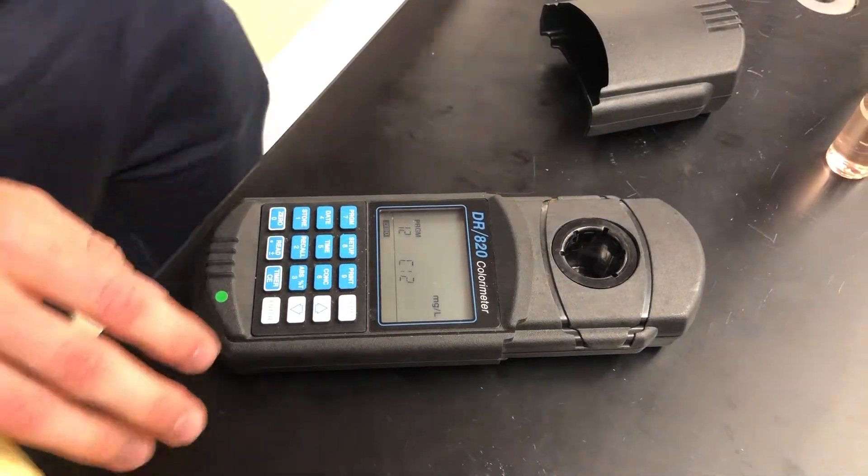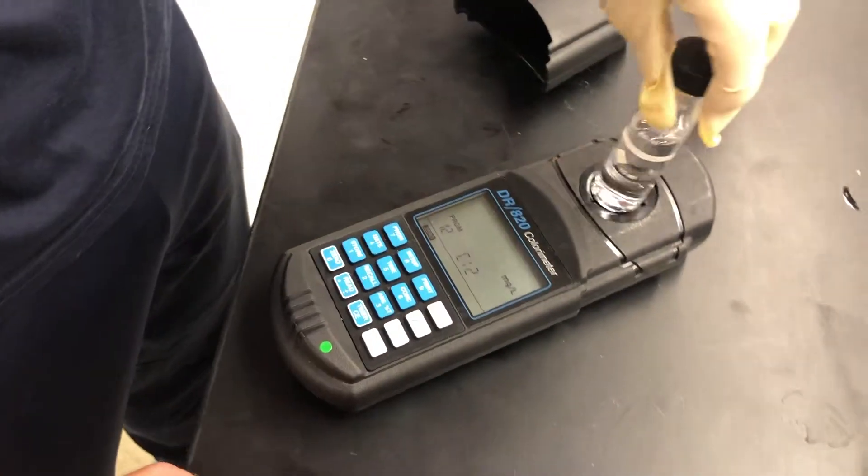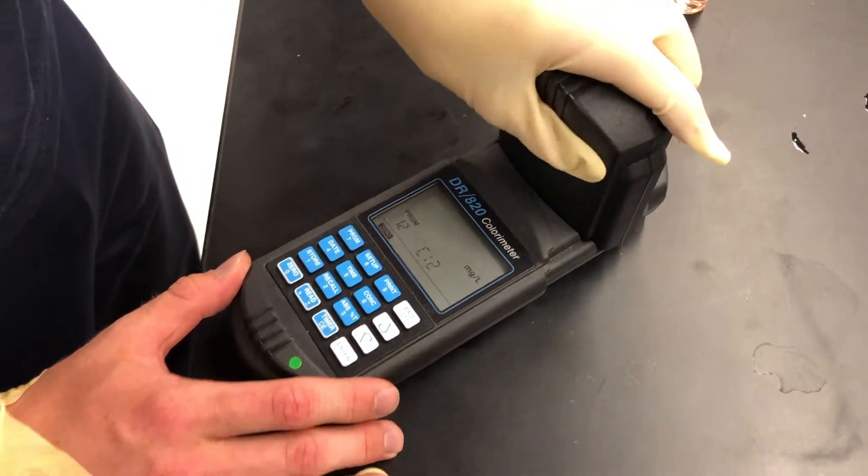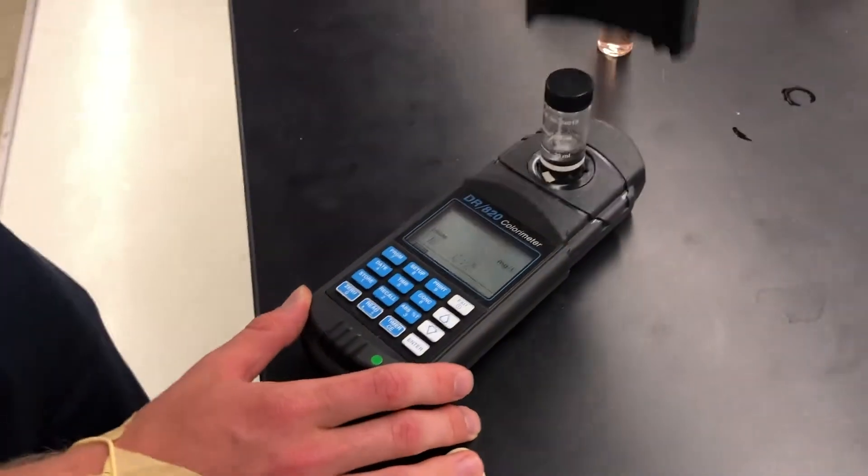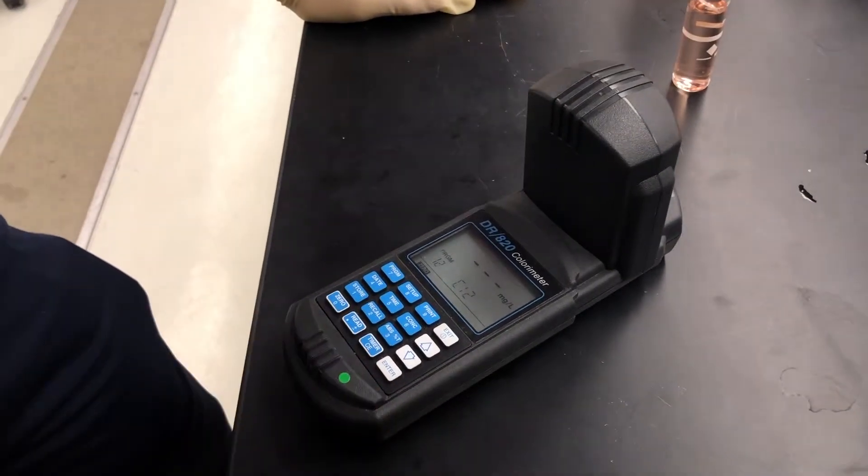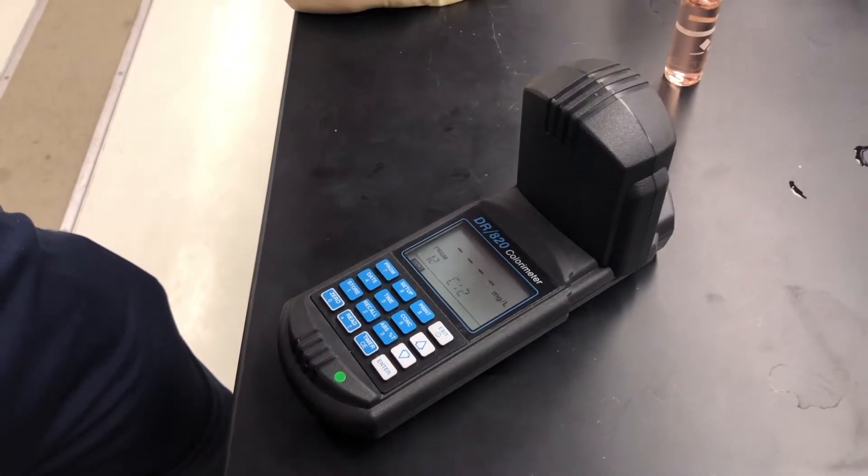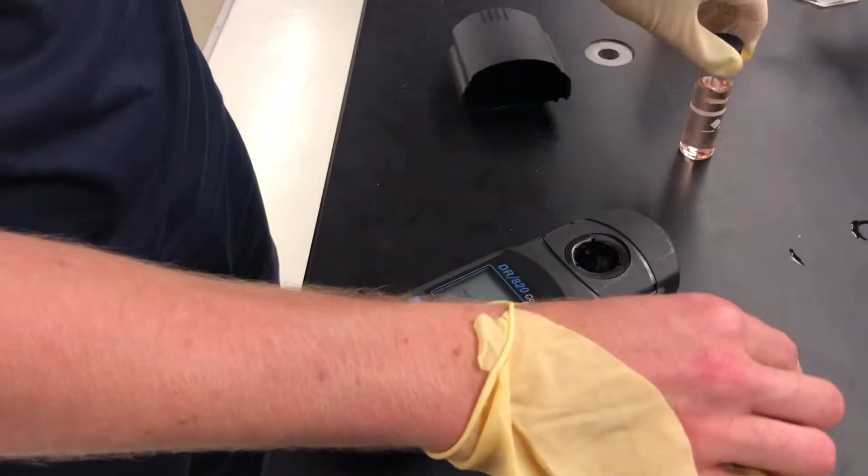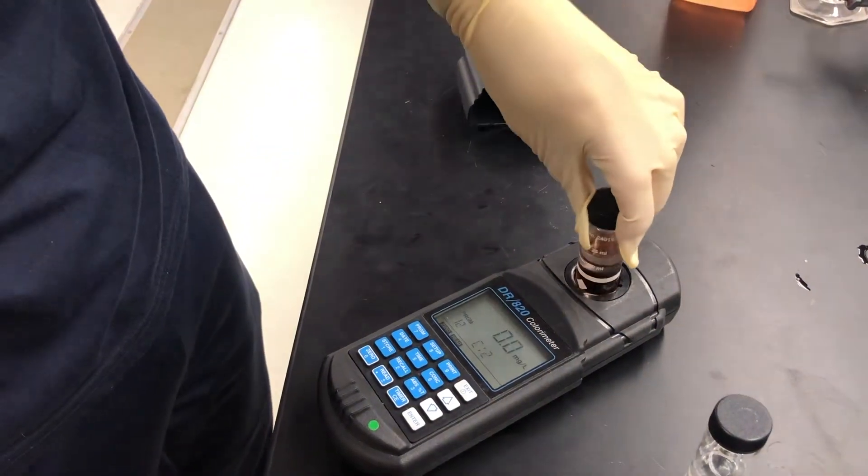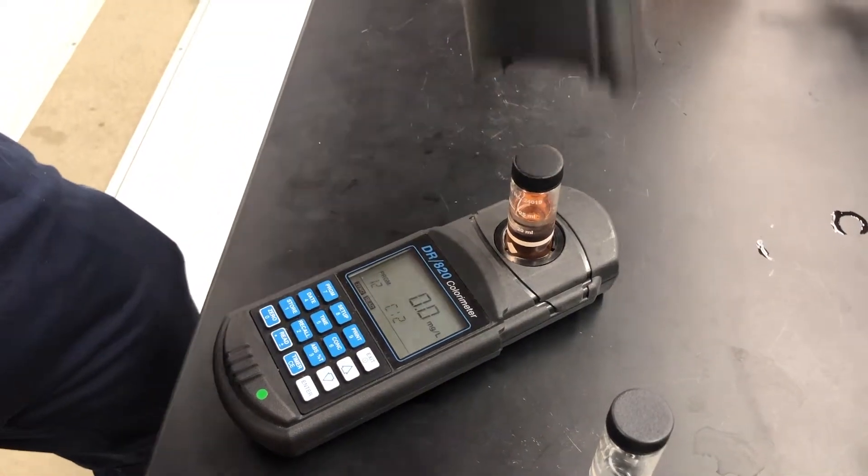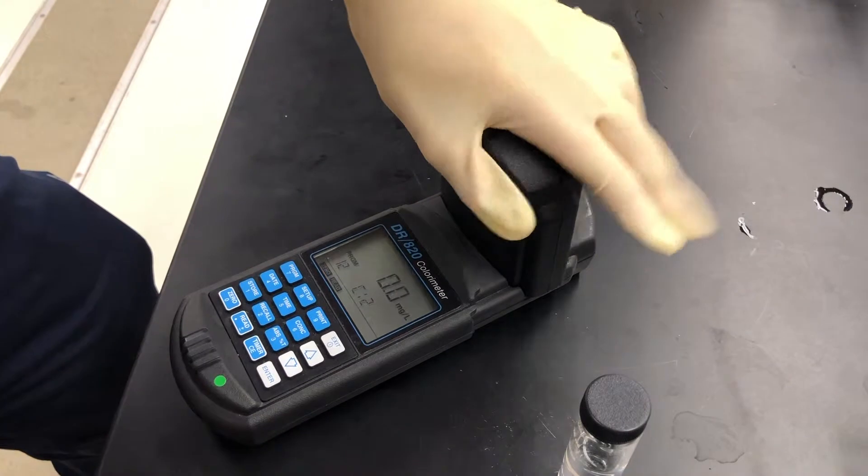We enter. We have to zero with the water. So we cover with this with diamond in front. Use zero. Okay. Now it's zero. You switch. You have the water. Make sure you wipe with towel to get fingerprints off. And now we read.